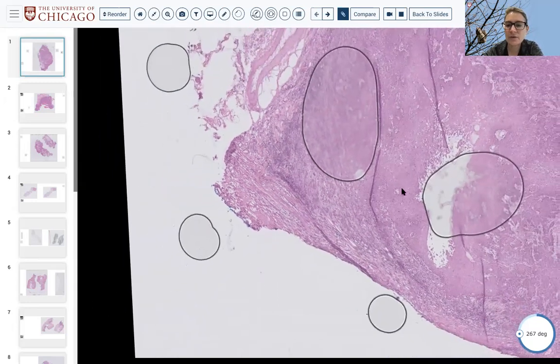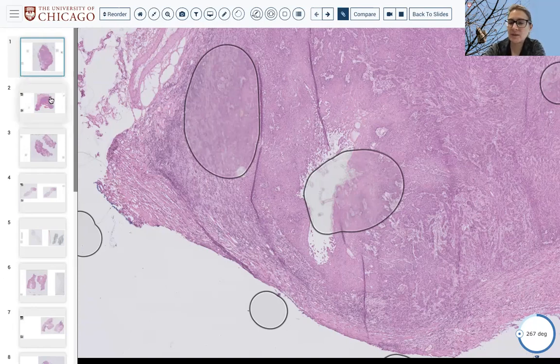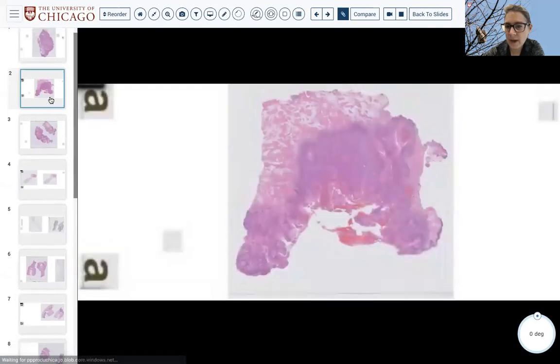Okay, let me counter that with, if you are evaluating the gross specimen and you don't see any tumor, like sometimes these are tiny little microinvasive carcinomas, you can call them up and say, listen, there's grossly nothing near margin. I don't want to freeze anything. We've done that. That's okay. They accept that. So consider that always if you don't have anything. But if you do have something that's close, please be as specific as possible when you're telling them how close and where it is.